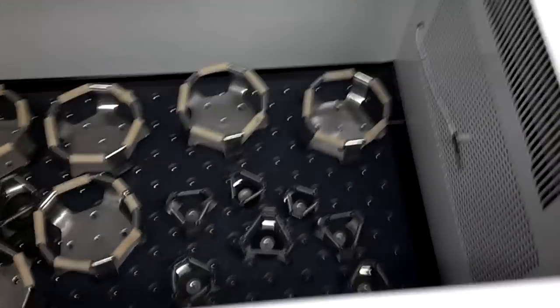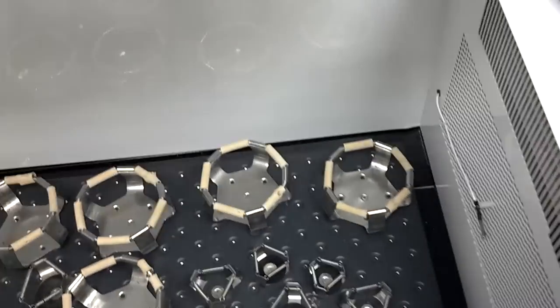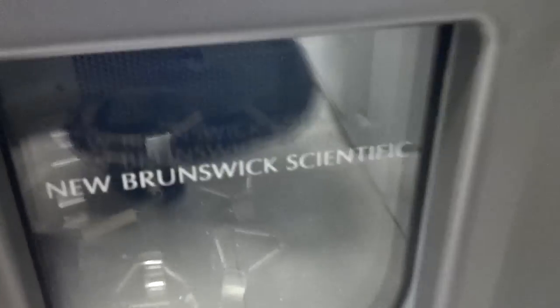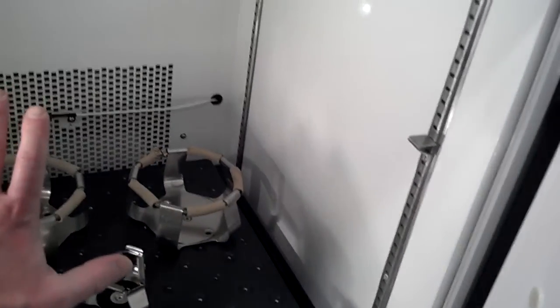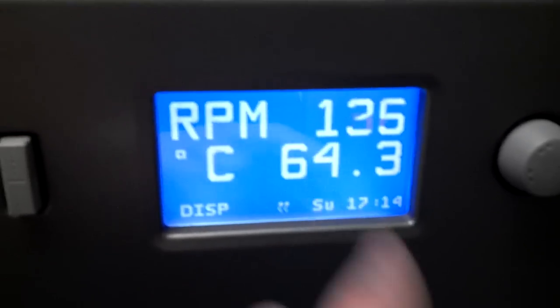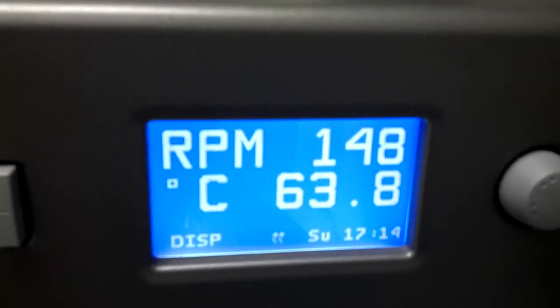This is a fat boy incubator. Put your samples in there in media, turn it on, your bacteria grows. Just like on a lot of people's feet. Here's another one. Here's the one I use. As you can see it's very hot and moist. It's the proper temperature for cellular growth. Usually we try to keep it around 65 to 75.